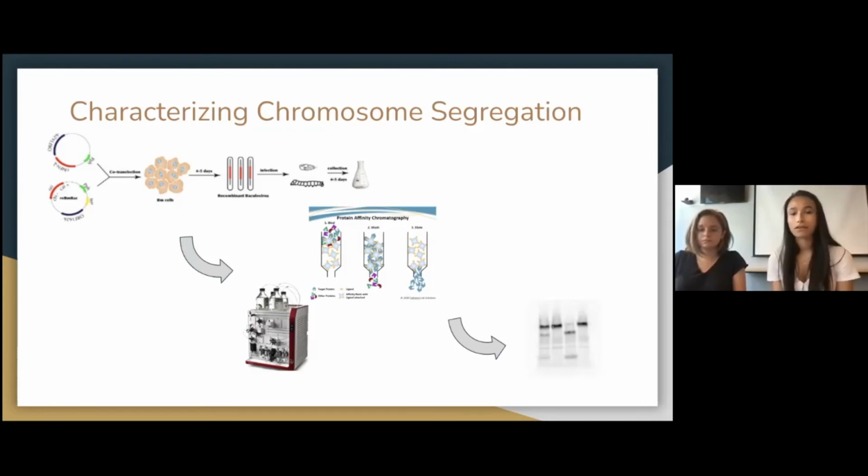And so now we have the purified protein that we're then able to include in biochemical assays. We're able to evaluate the activity of the proteins, how they interact with other proteins. And that just helps us get a better understanding of how the process of cell division works.